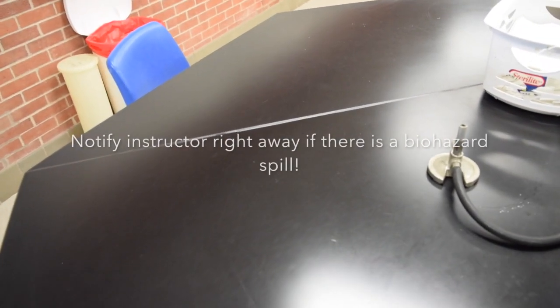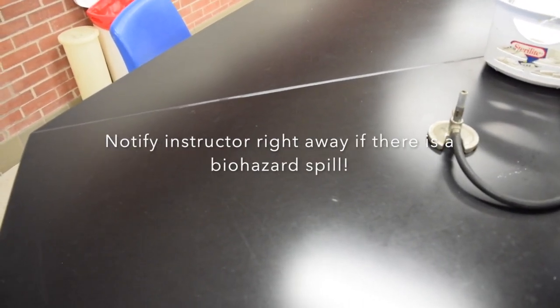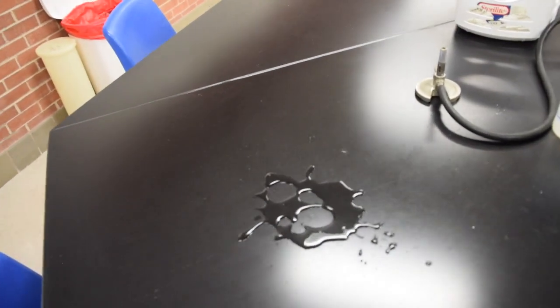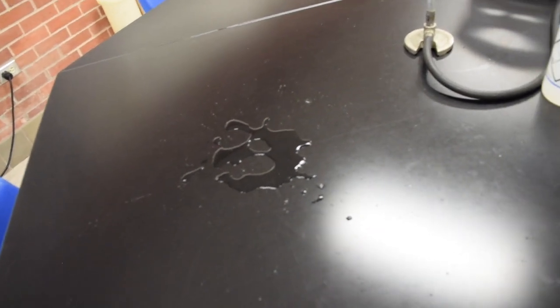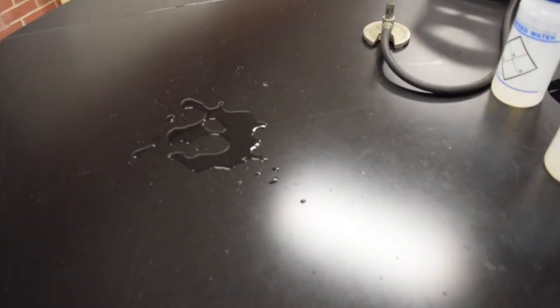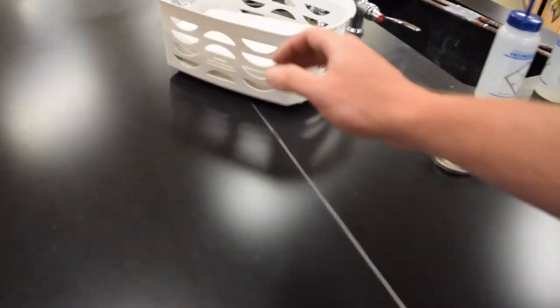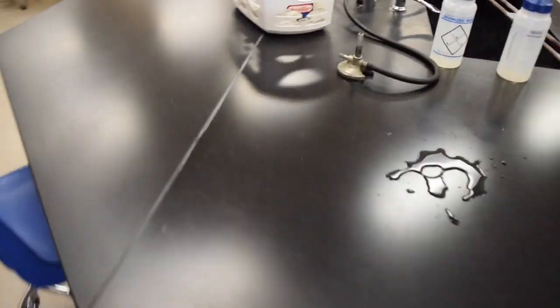Now if there was a biohazard spill, a lot of times people might drop by accident a test tube. Here we have some bacteria that was spilled. That bacteria splatters, usually I've had it shoot five, six feet onto the floor. The reason why we have our safety glasses and lab coats is so you don't get sprayed.